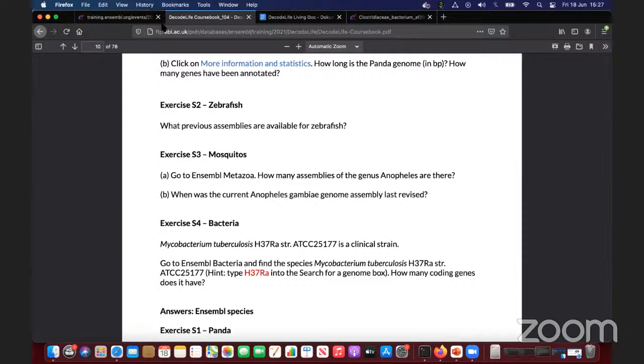However, yet again, genome browsers are more about browsing the existing data produced by us rather than performing your own analysis. You can also obviously use the reference files that we provide and certain tools to mine the data and so on. But if you tell me a little bit more about the analysis you're thinking of, if you're more specific, that will be helpful.